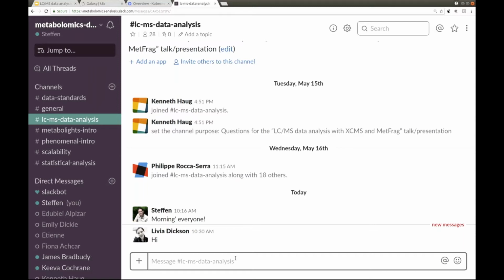We can also bring in separate measurements. So you can get the MS1 information from a pure metabolite profiling run. And then you might have dedicated MSMS runs, maybe on your QC sample, because you have more sample amounts that might be convenient.